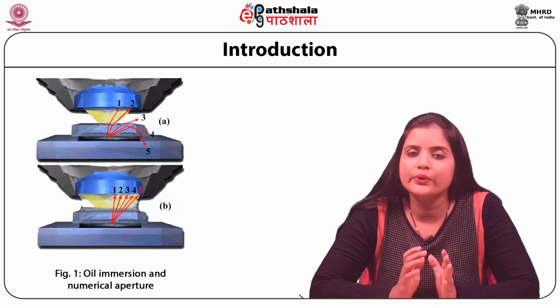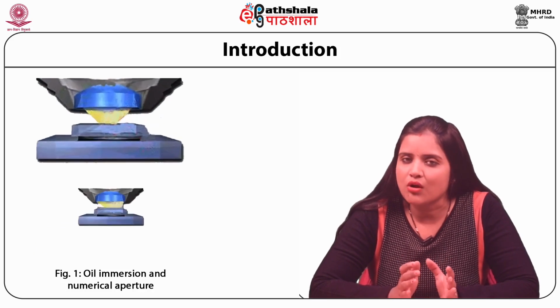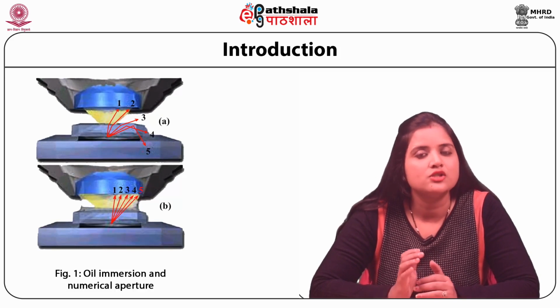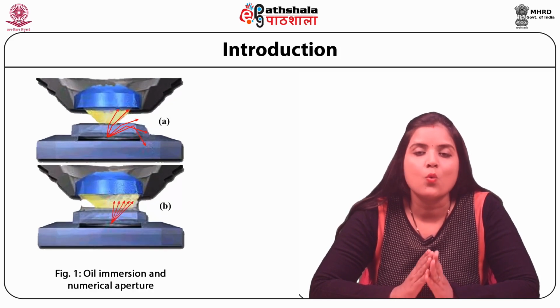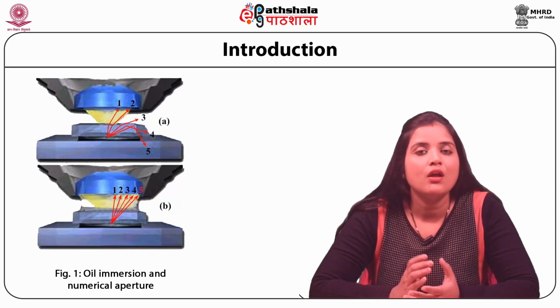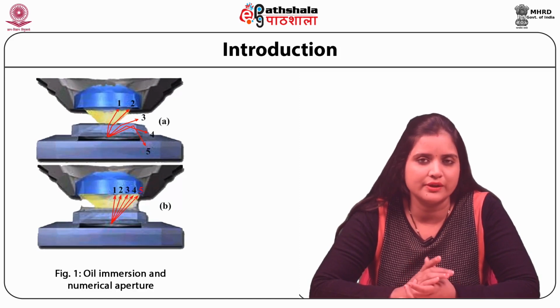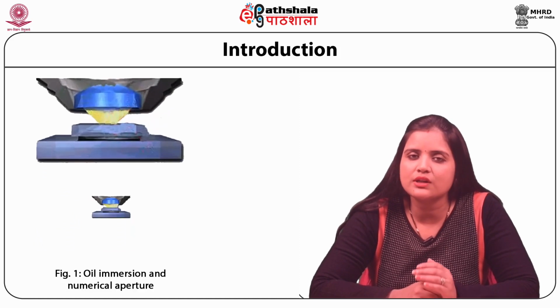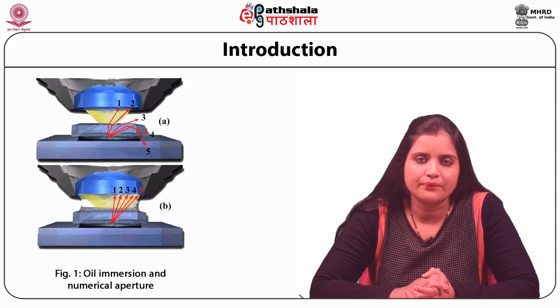Immersion oils are used in microscopy owing to their transparent nature, viscosity, and specific optical characteristics. Typically, oils having a refractive index around 1.515 are preferred. The oil immersion objective is a specially designed objective lens which can be utilized in this way. After immersing in oil, many condensers give optimal resolution.